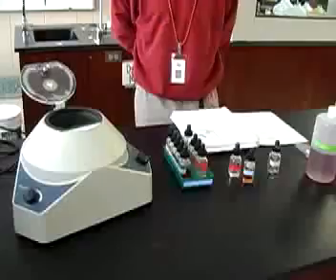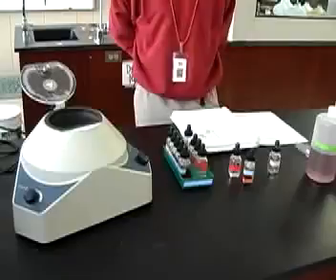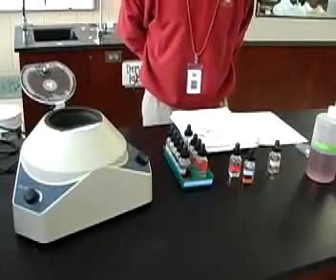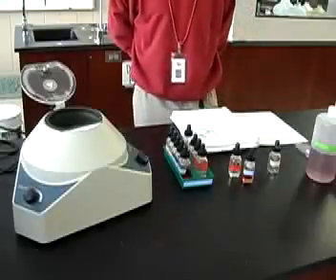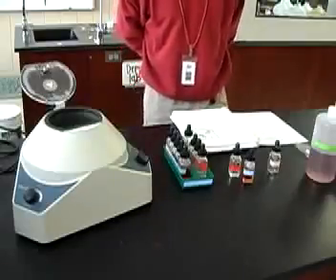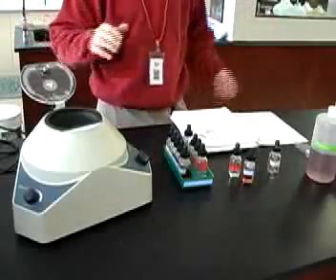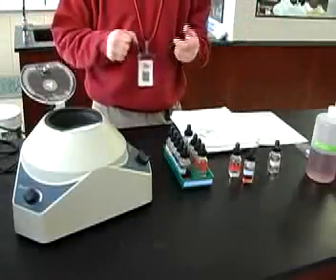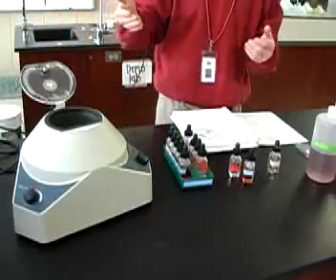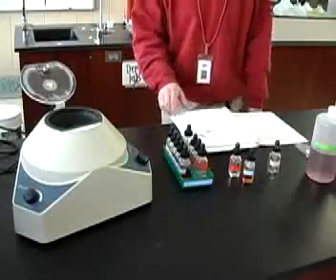The next page, it says on mine 125, washing precipitates. It's almost always necessary to wash precipitates to free them from ions, which might cause confusion later in the steps. To do this, add 1 to 2 milliliters of distilled water to the precipitate, stir it again, centrifuge it, and discard the wash water. Sometimes the directions will tell you to include a specific reagent in the wash water. There'll be lots of bottles of distilled water around here, and people really like to have their squirt bottle filled all the time. And some people get really particular about where their stuff is. So if you're in an hour, realize that people the next hour will be using the same equipment, so put it back where you found it.